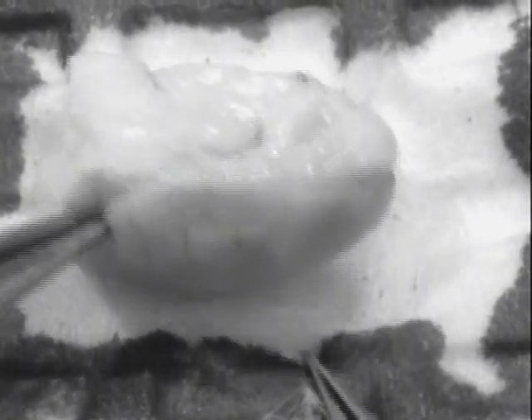The hippocampus is sort of cupped inside of the cortex, beneath the thalamus and midbrain structures.